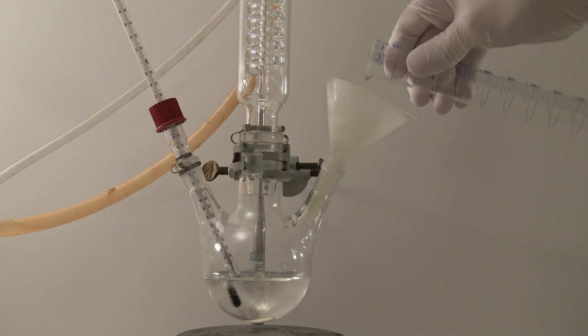Acetaldehyde is a CH acidic compound and can be deprotonated by a base, which leads to the enolate. This can act as a nucleophile and attack the carbon of the aldehyde group in the benzaldehyde. The charged aldol is protonated and the uncharged aldol is formed. The aldol loses water and an alpha-beta unsaturated carbonyl compound is formed, which is cinnamaldehyde.